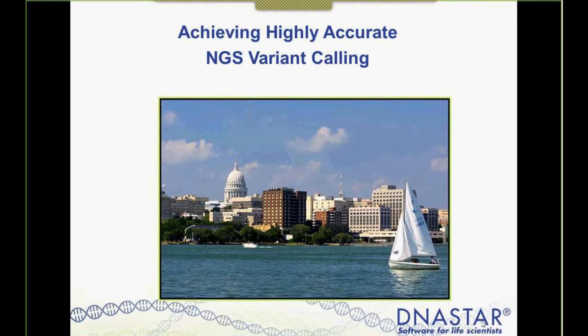So I thought I'd start today with a little background in some PowerPoint slides regarding one of our new workflows, which allows us to achieve highly accurate variant calling with NGS data. And more importantly, we provide means to the customers to determine the accuracy of their own workflow.